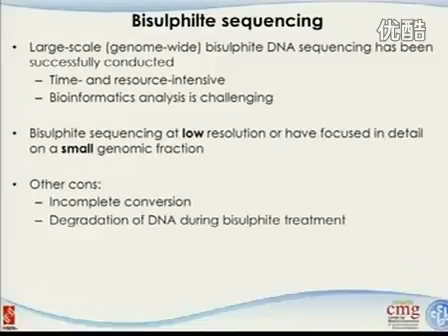But before they do any experiment, they will systematically evaluate every single potential restriction enzyme. They will see where the cutting will occur, and if they have some important regions they want to focus on, they will pick this restriction enzyme and size and do the size selection. And that sometimes can recover over 80% of the regions they are interested in.